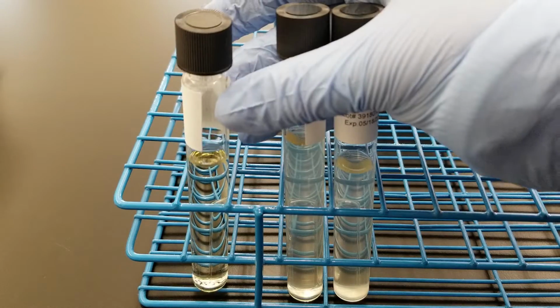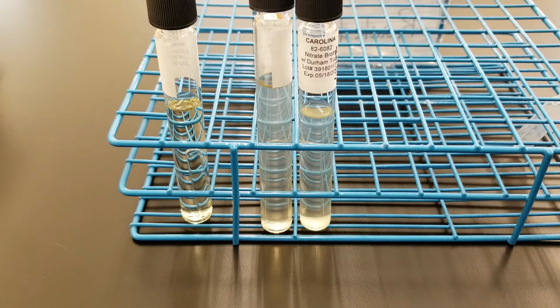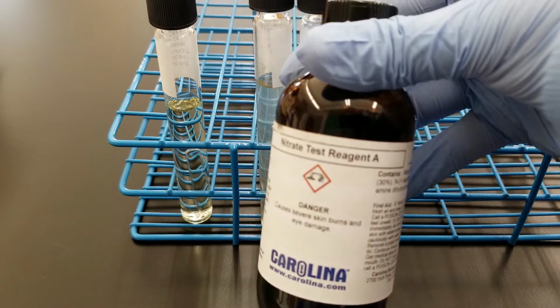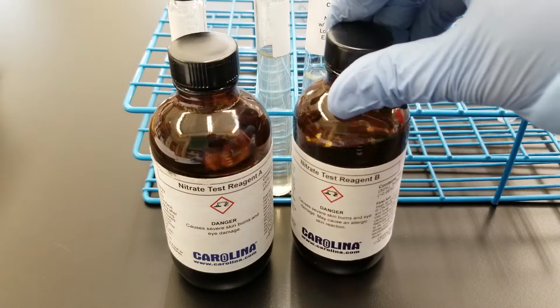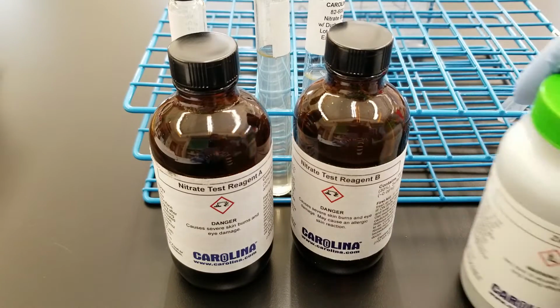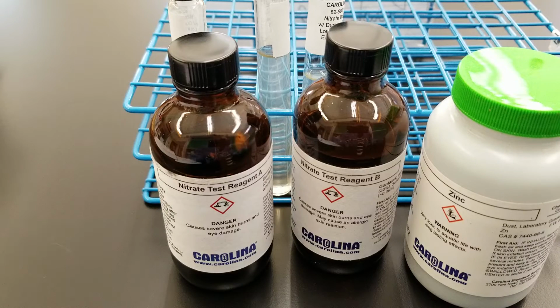So these are the 3 that we did. What we're going to do now is hopefully keep everything in focus because I'm having trouble with that. This is reagent A. We have 3 reagents we're possibly going to use. We have reagent A, reagent B, those are liquid, and then we have zinc dust, which we use only if necessary. So let's talk about this.